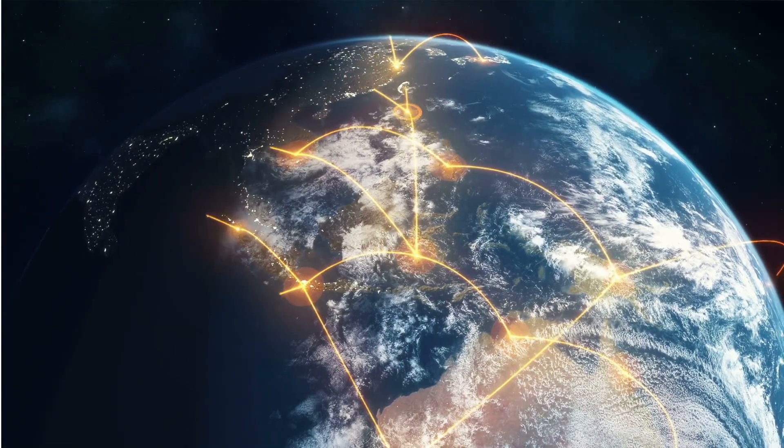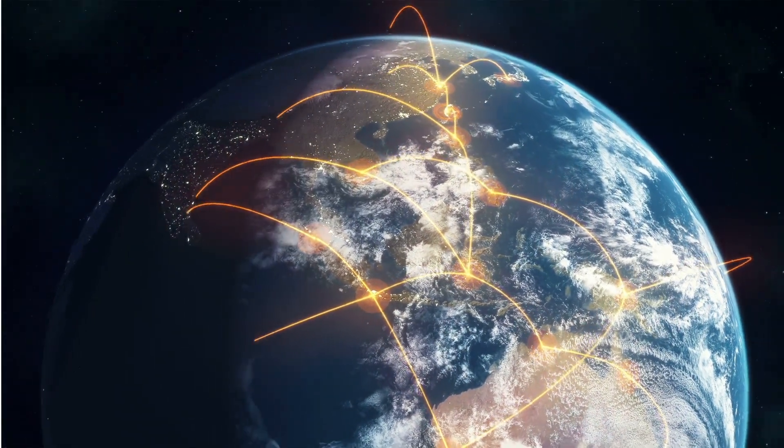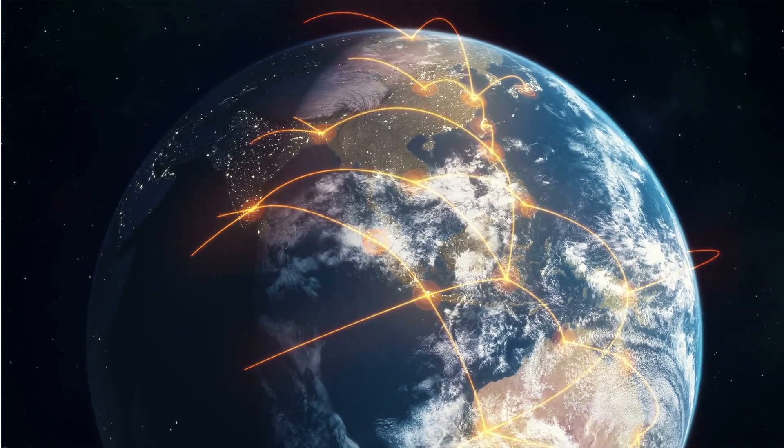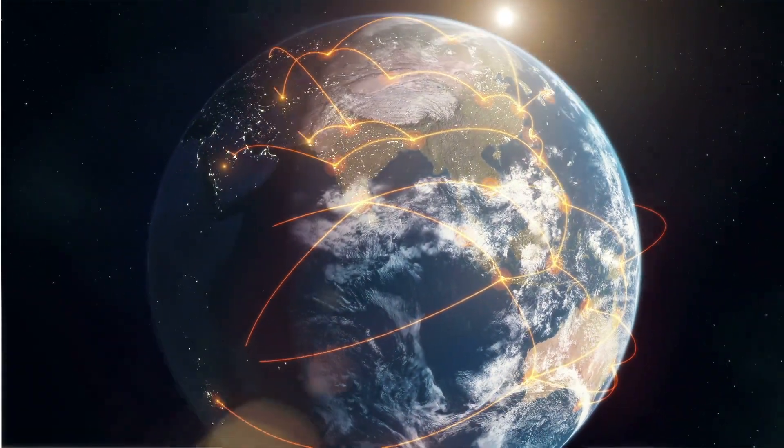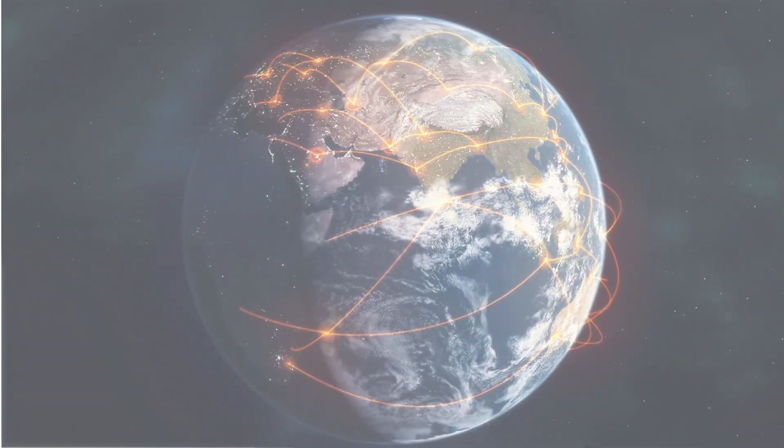It enables seamless handovers of samples and data between different sites and groups, as well as external partners.